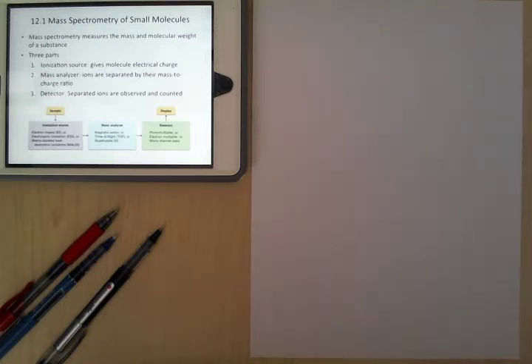And then at the end, we'll have a detector, and so you can see how many of each mass size is coming and hitting. Literally, what you're doing is you're counting how many strikes, how many masses of 100 are there, or 101, or 102, or 103. That's what you're looking for at the end: how many times for that particular mass it hits the detector.